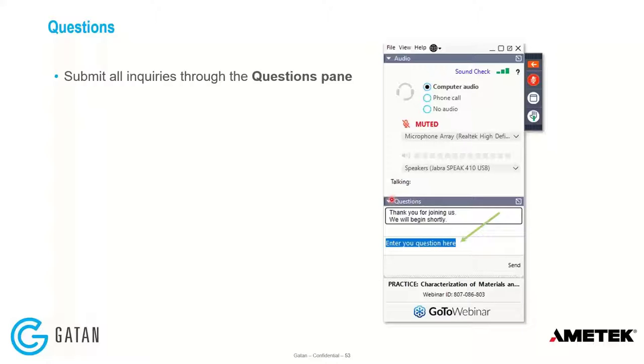But for individual problems, you really want to use a dummy region to establish your probe current. Mm. Yeah, that's true.